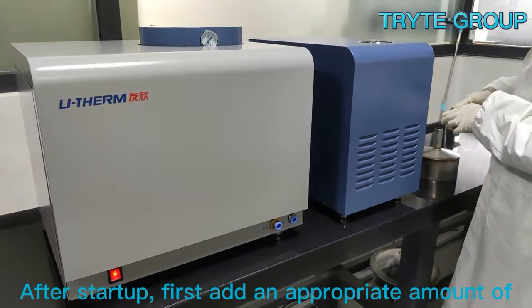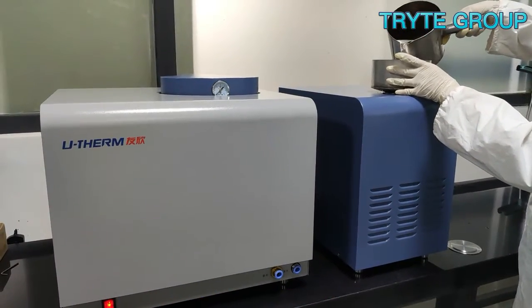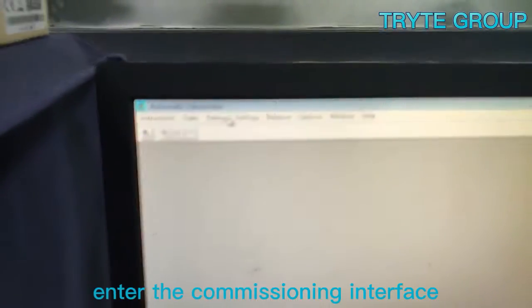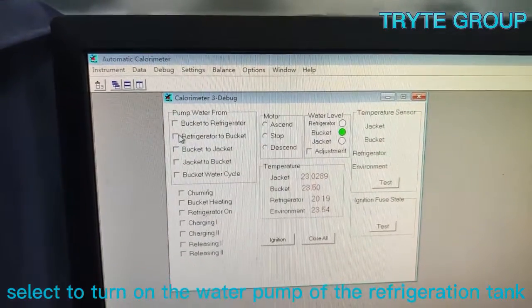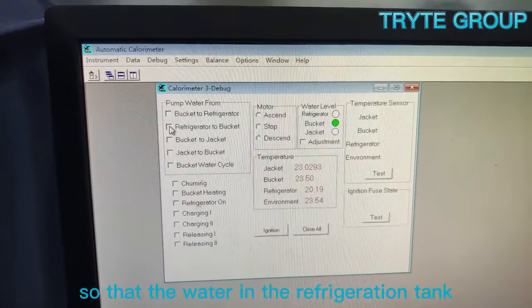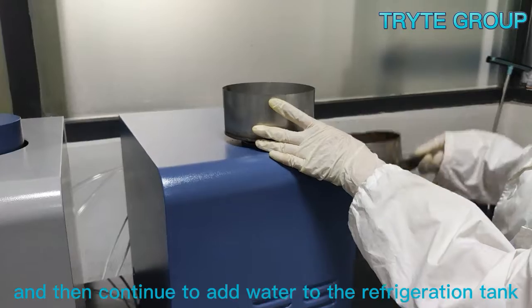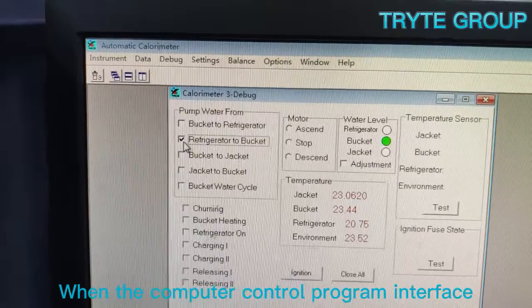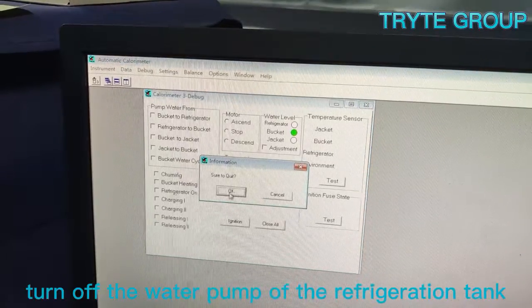After startup, first add an appropriate amount of purified water to the refrigeration tank. Then turn on the computer, select the program, select the corresponding instrument icon, and enter the commissioning interface. Select to turn on the water pump of the refrigeration tank so that the water begins to flow to the outer barrel of the main tank, then continue to add water to the refrigeration tank. When the computer control program shows that the outer barrel of the main tank is full, turn off the water pump of the refrigeration tank.